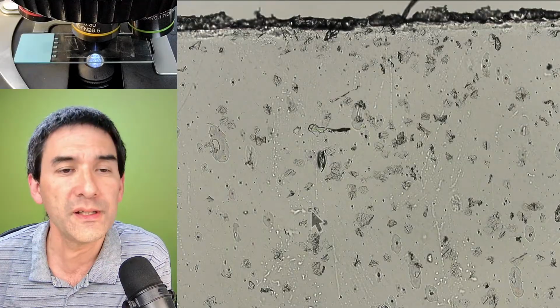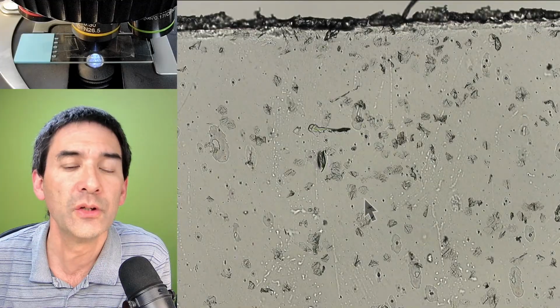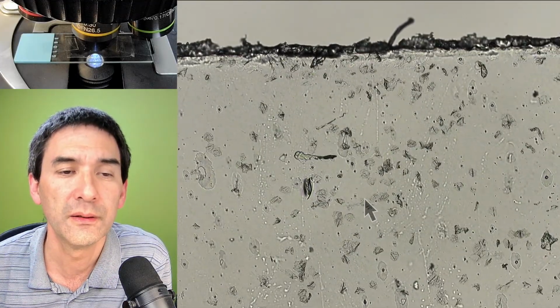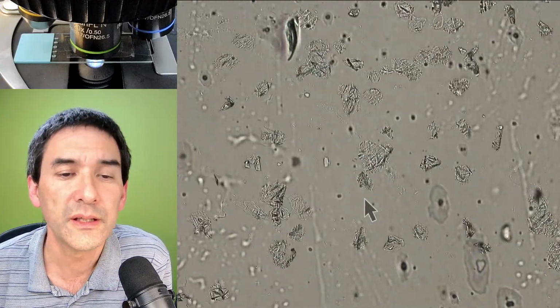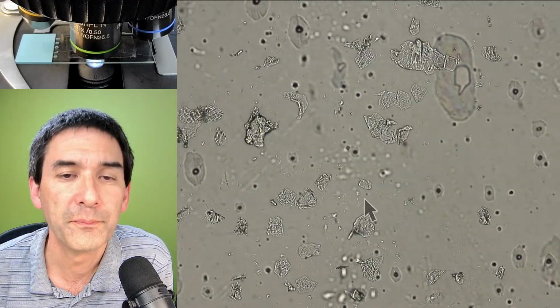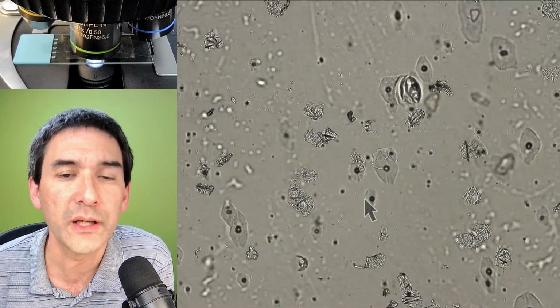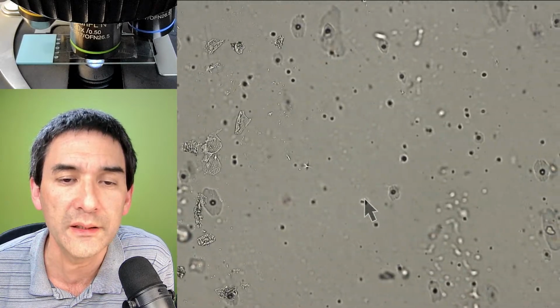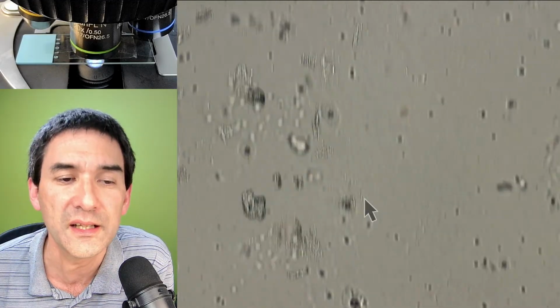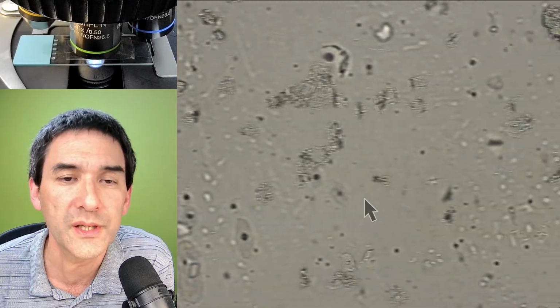Yeah. So there is something longer over here. So I'll be zooming into that one to have a look. Okay. Yeah, and no, that's nothing, right? So let's have a look here. Usually what I do is I kind of scan back and forth. And every time when the density of the skin cells goes up, then I know that I'm in the area where I actually collected. And then over here, the density of the skin cells goes down again.